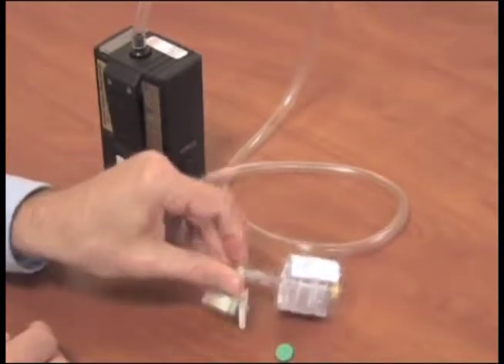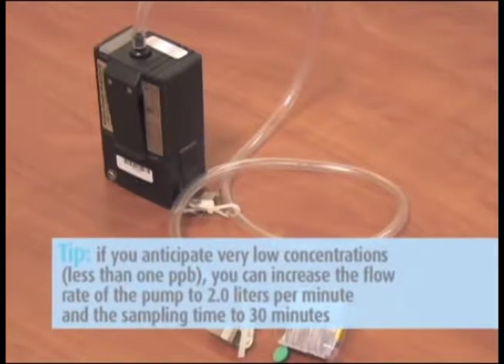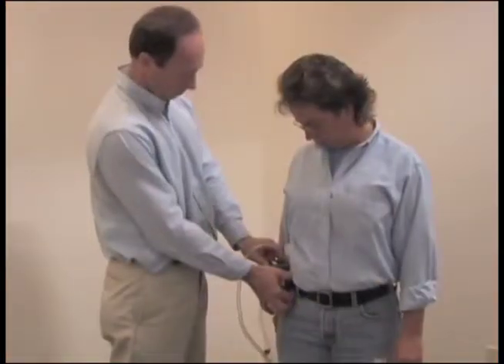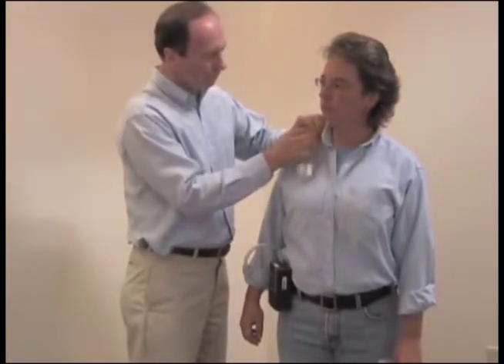Recommended sampling time is 15 minutes at 1.0 liters per minute. Tip: if you anticipate very low concentrations — less than 1 ppb — you can increase the flow rate of the pump to 2.0 liters per minute and the sampling time to 30 minutes.